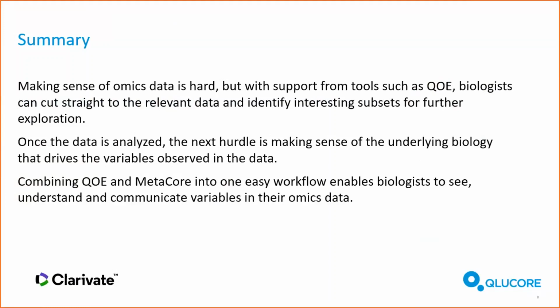She exported it from Qlucore and we uploaded it to MetaCore, and then used MetaCore to explore the underlying biology behind those variables.